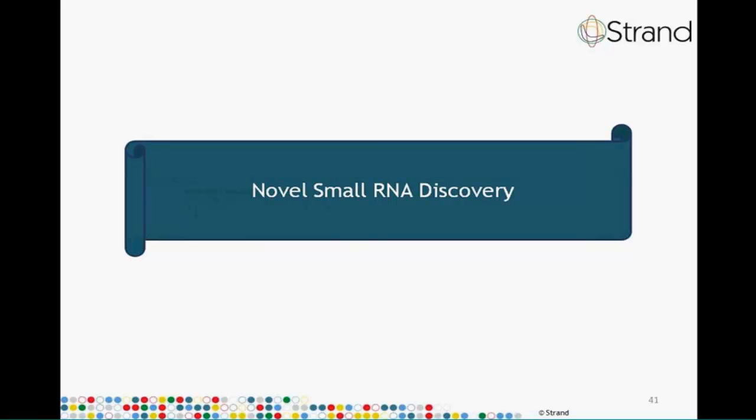One of the main reasons for carrying out NGS analysis is to discover novel small RNAs and genes. The novel small RNA discovery starts off by looking at sections of the genome which have a lot of reads, but there is no annotated gene in the vicinity of that enriched region. Suppose you had one such enriched region. We could call it a small RNA, but then we would have the question of what type of small RNA it is. Is it a microRNA gene? Is it a snRNA gene, etc.? So in the novel small RNA discovery process in Avadis NGS, we first find these enriched regions, then we try to classify the enriched region as one of the specific small RNA gene types.